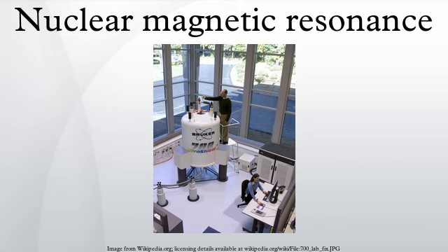Earth's field NMR. In the Earth's magnetic field, NMR frequencies are in the audio frequency range, or the very low frequency and ultra-low frequency bands of the radio frequency spectrum. Earth's field NMR is typically stimulated by applying a relatively strong DC magnetic field pulse to the sample and, after the end of the pulse, analyzing the resulting low-frequency alternating magnetic field that occurs in the Earth's magnetic field due to free induction decay.